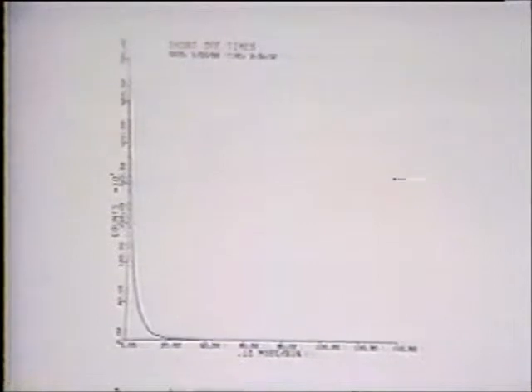Here's a plot of the closed times. Again, at 100 microsecond increments. At this time scale, it's roughly a single exponential. There's a plot here with a 10 millisecond time, and there are very few counts that are visible at that time scale.